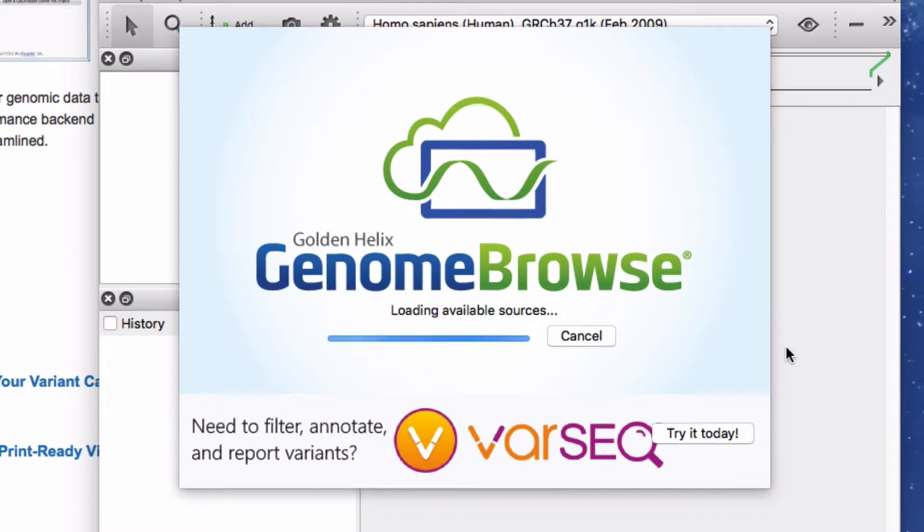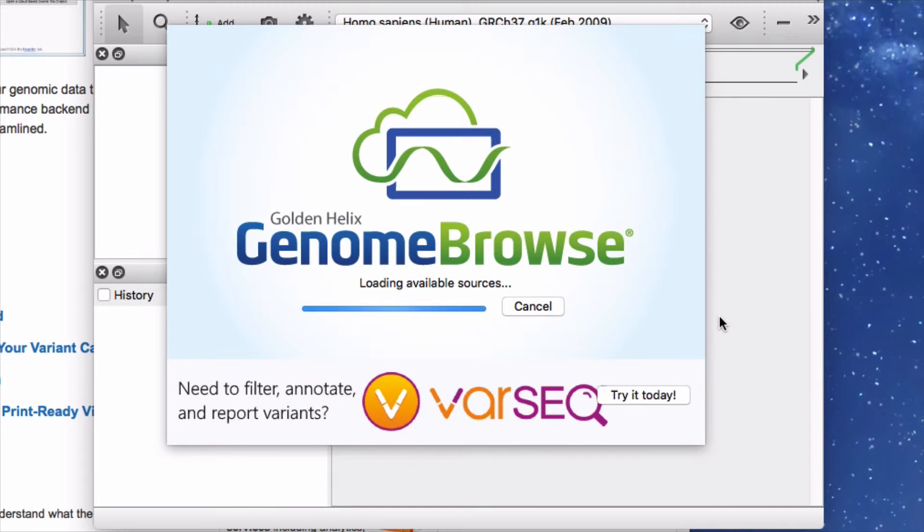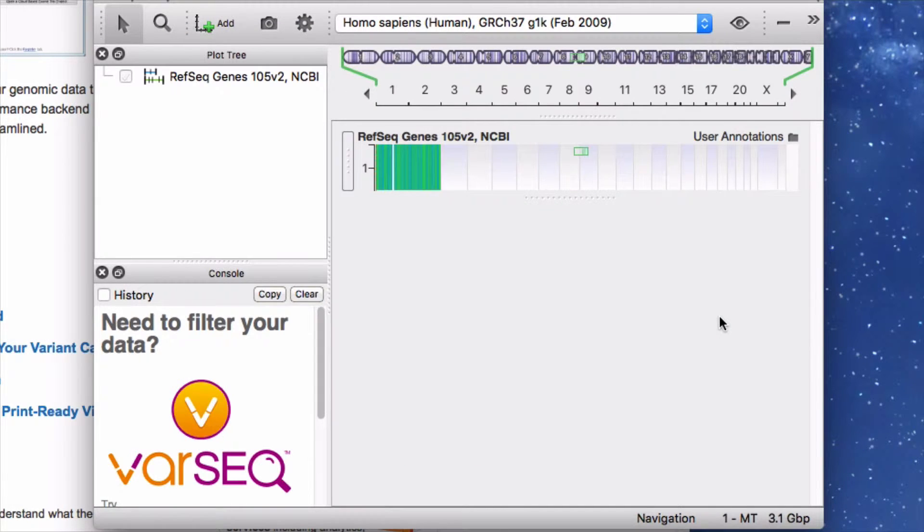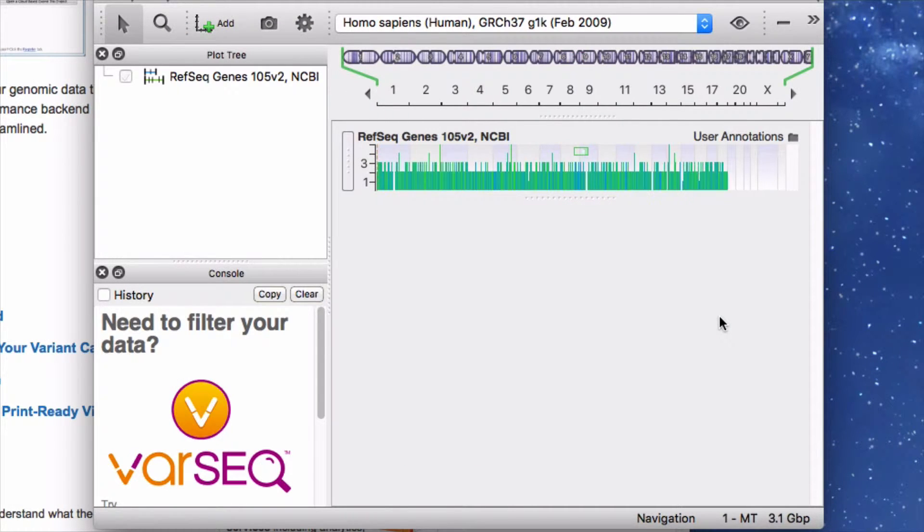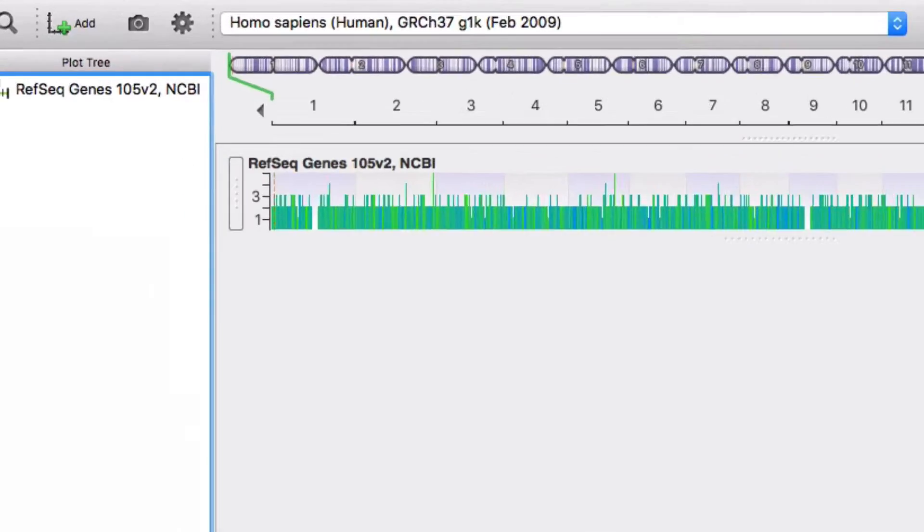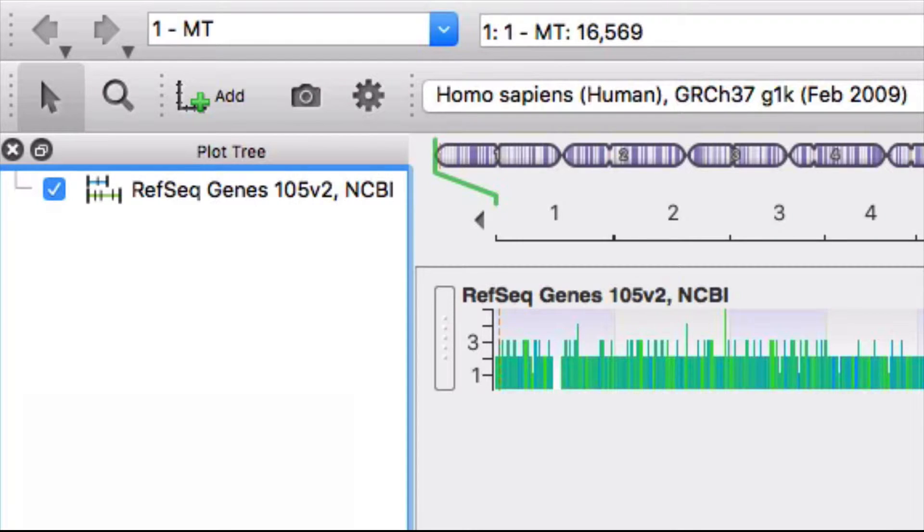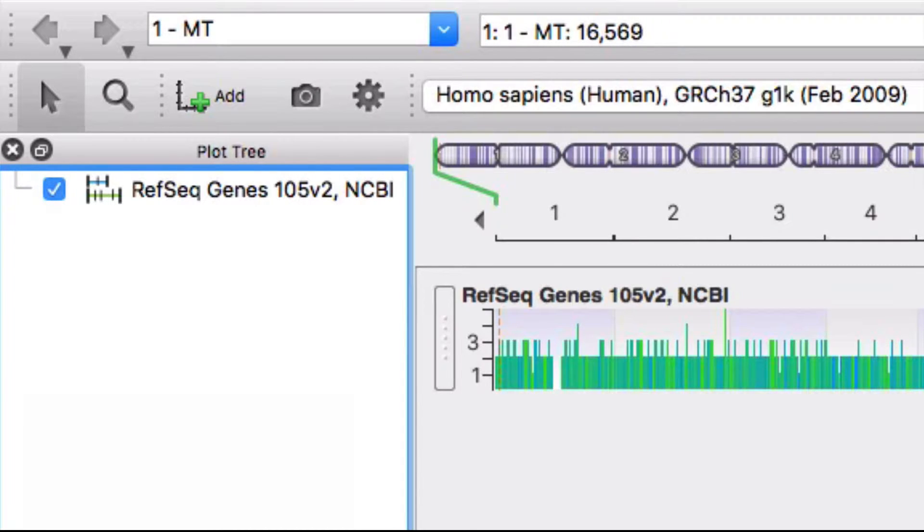Genome Browse opens with a display of RefSeq genes, a collection of nucleotide sequences that code for protein products. In the RefSeq track, gene transcripts are represented in a diagrammatic format.